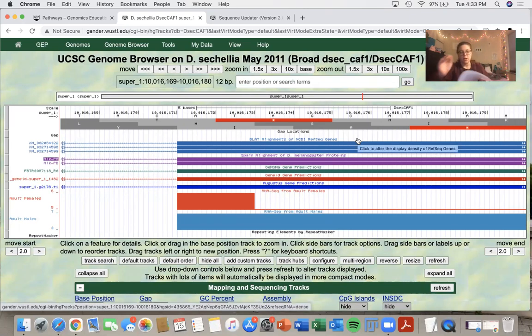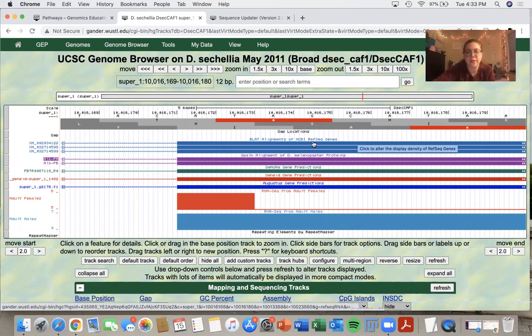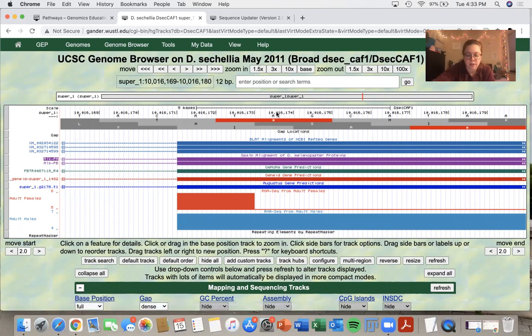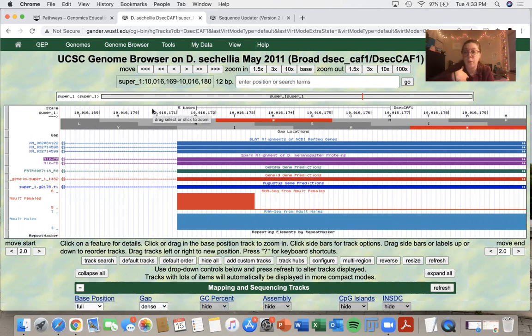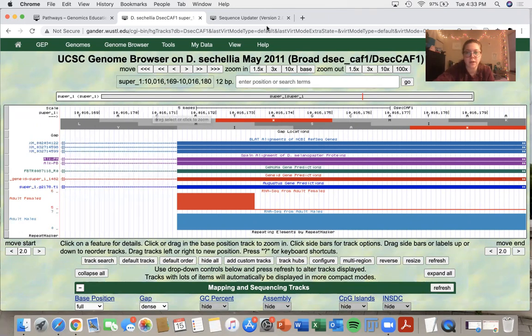Great. So the final three bases of this exon six here are A, T, A. So this is where I want to begin updating my sequence. So I'm going to navigate back to the sequence updater.